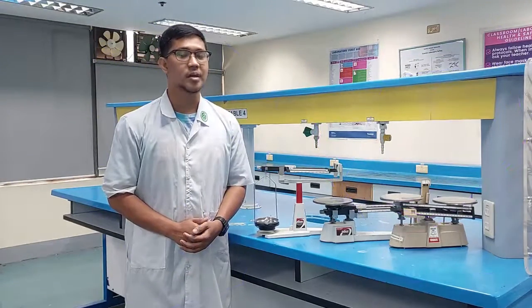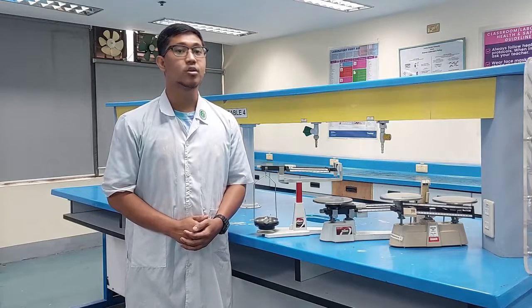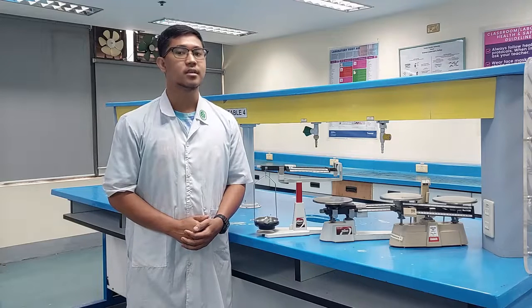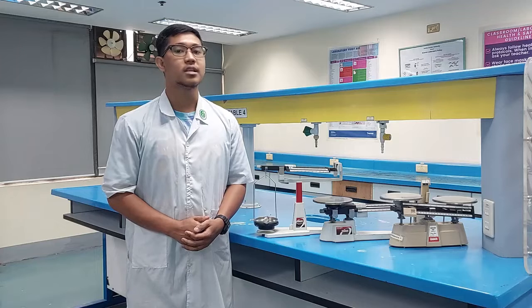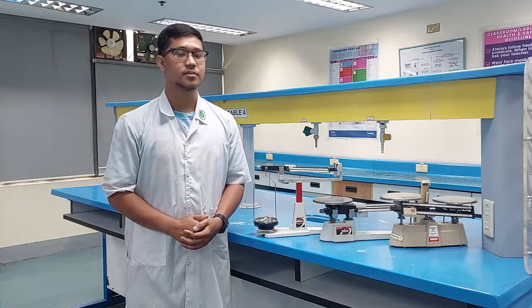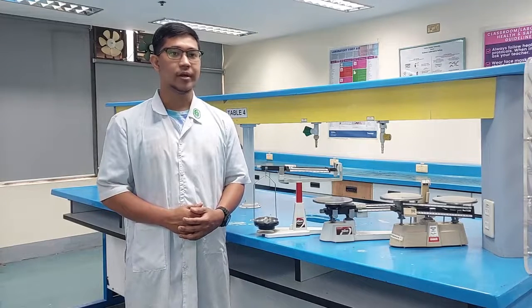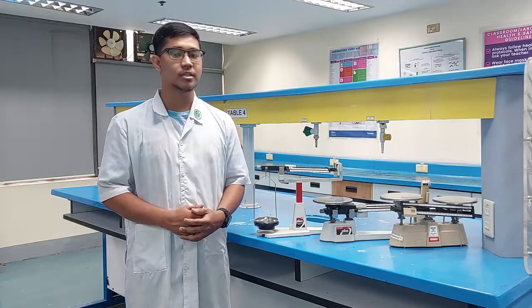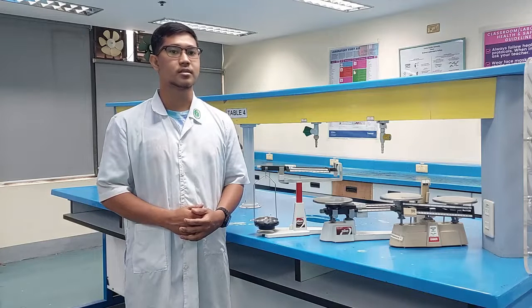There are two ways of measuring mass: direct and indirect weighing, also called weighing by difference. Direct weighing means that an object is placed directly on a balance and the mass is weighed. Weighing directly requires that the balance be carefully zeroed in order to obtain accurate results. The second way is weighing by difference. Weighing by difference requires that two measurements be taken. These measurements can be taken in one of two ways.